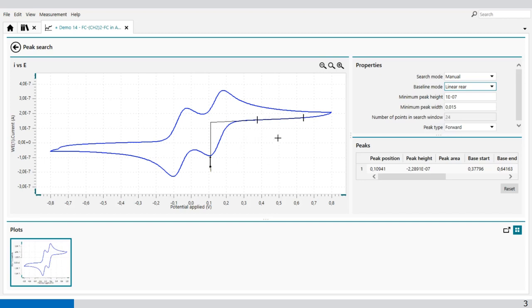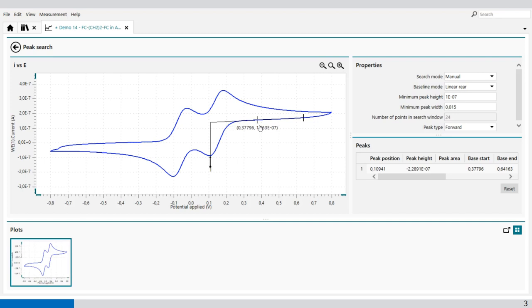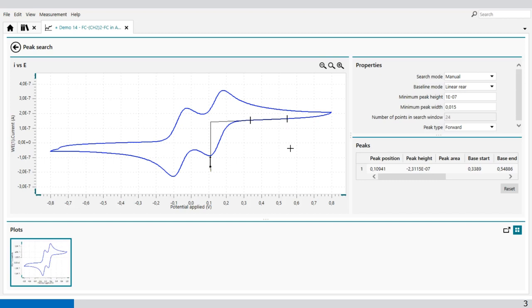When you want to modify the points you've marked, you go to the points. And then the curve will change into an arrow. When you hold your mouse key, you can drag left to right to a different position to define the position of the markers. The same you can do for the other one as well. So this way, you can always modify the peak search.